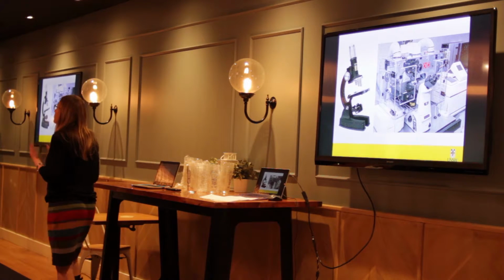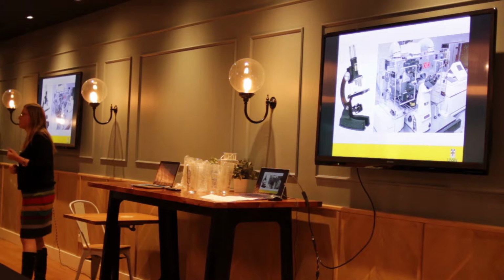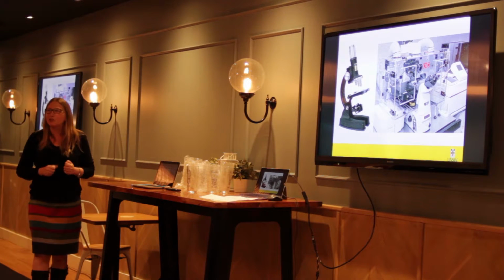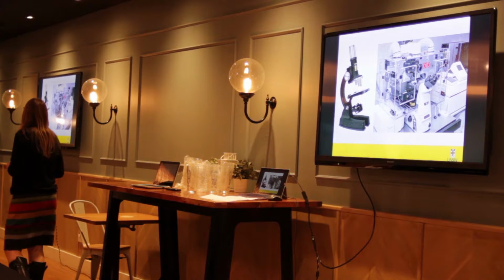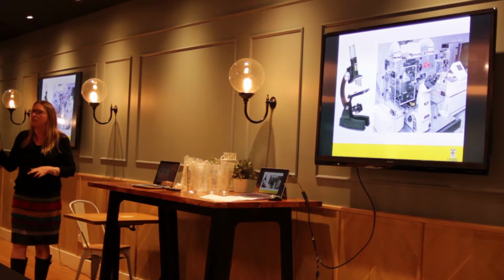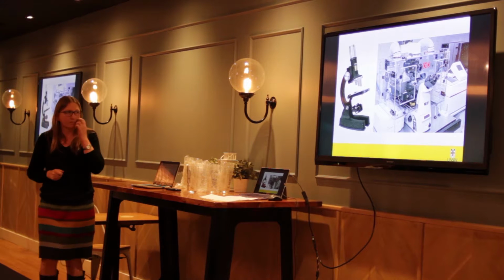We can capture lots and lots of photons. They use a pinhole and lots of mirrors. Same thing about perspective. However, they don't cost $80. Not surprisingly, I have $13 million worth of microscopes in my lab. One like that you see there is in the order of between 350 and 500K. These are scientific tools that can do some really remarkable stuff.